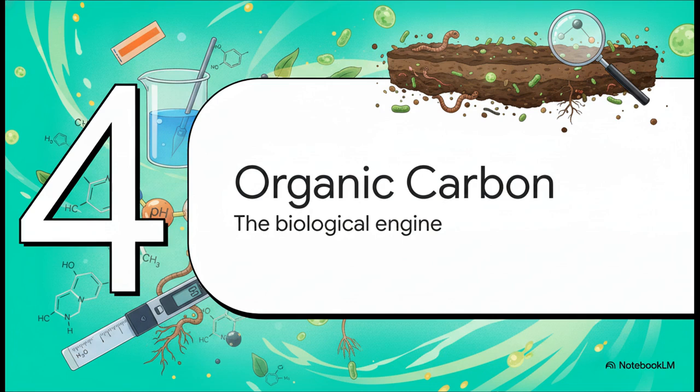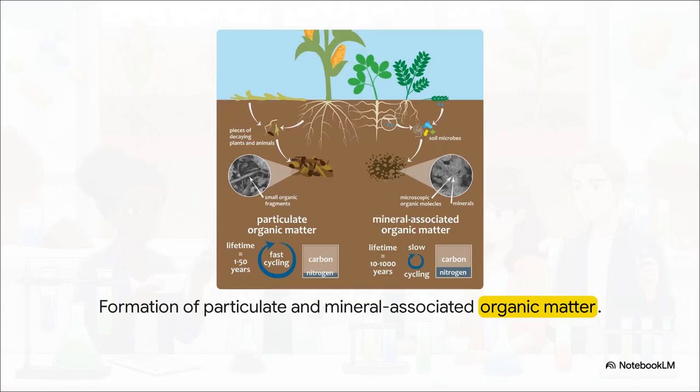So we've got our pH. Now we need to quantify the biological side of things. Welcome to Section 4, determining organic carbon. Soil organic matter is the engine of this entire ecosystem.